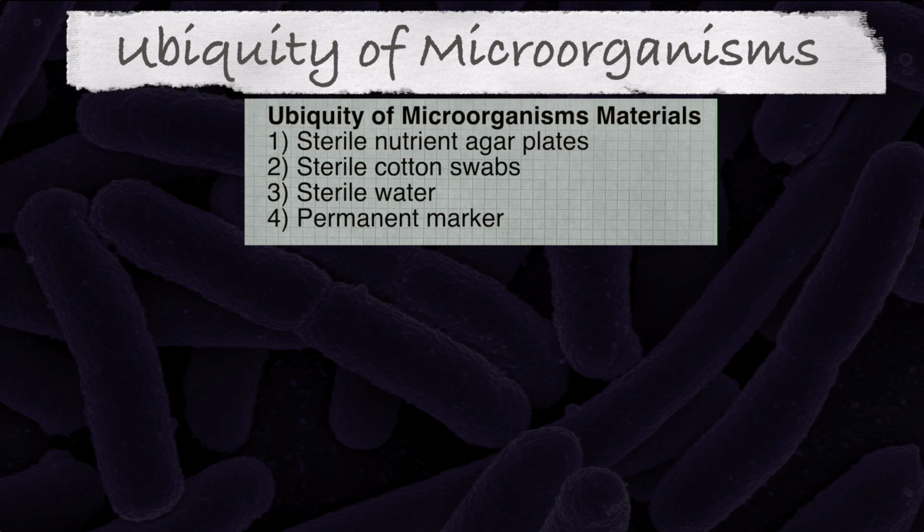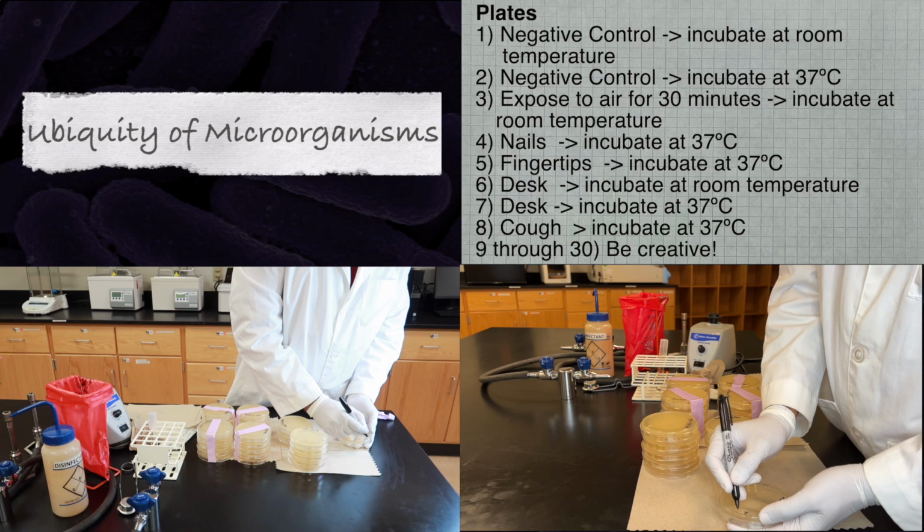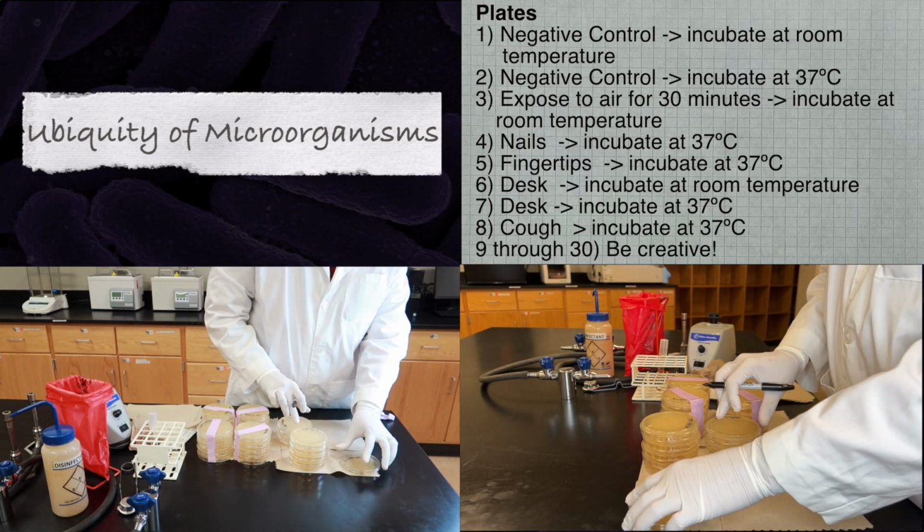In order to perform today's lab, you're going to need the following materials: sterile nutrient agar plates, sterile cotton swabs, sterile water, and a permanent marker. As a class, today we're going to sample and culture from several locations. We will begin by labeling our Petri plates.